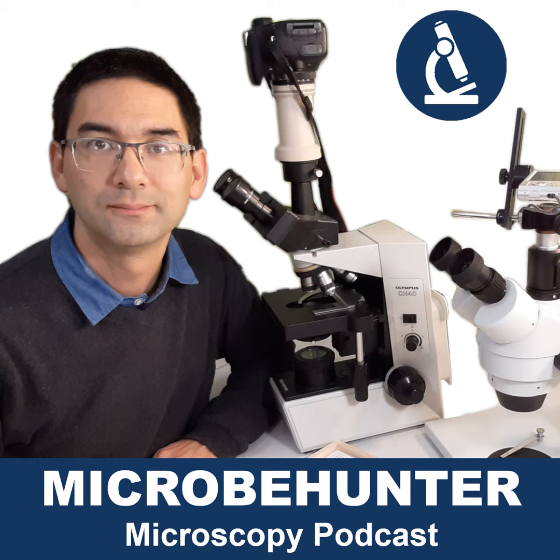I'm going to have a separate episode simply on buying a microscope, but that's a little bit the thing here. It's probably better to save a little bit of money together and buy yourself a slightly better microscope than to simply spend too little money. On the other hand, you can already get very decent devices for a low amount of money. It depends. There are so many parameters and factors that play a role, and I think this might make it also difficult for especially beginners to make a decision here. But in any case, I'll just leave it as it is right now.